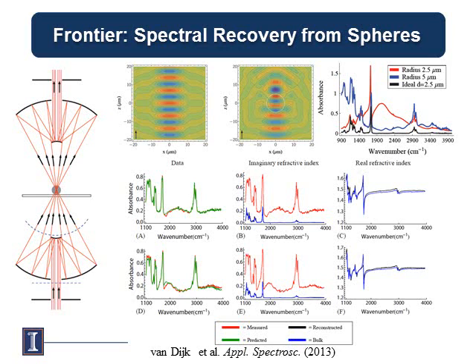This is perhaps the most challenging problem in IR microscopy that we could think of. It seems rather trivial, but this is a sphere that is of the same size as the wavelength of light that you're using, and it's a three-dimensional object. So it turns out to be a rather complicated thing. But what saves us here is the fact that we know it's a sphere, so we can predict things quite easily. We also have a full framework now to predict things if it wasn't a sphere, if it was some arbitrary object, if it were a piece of tissue, for example, and we can do that. The same ideas hold, but that's an even longer story, so I won't go there.